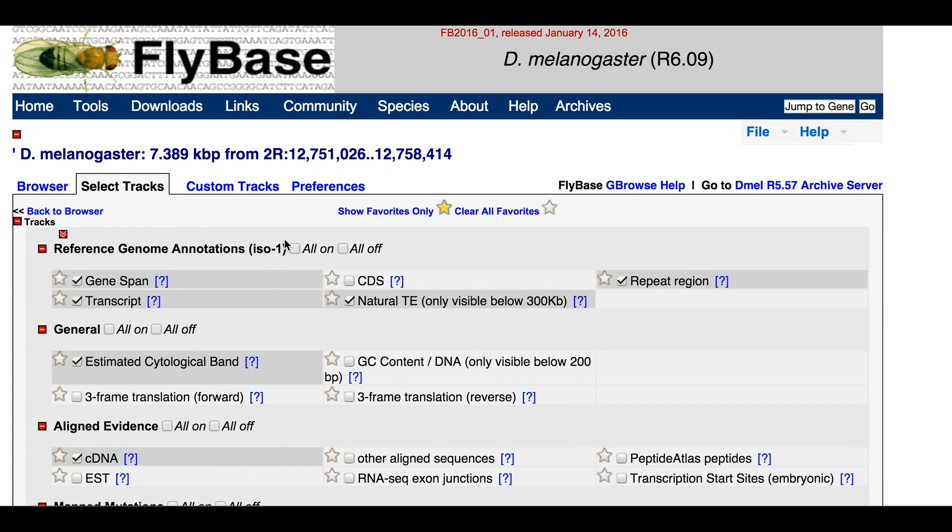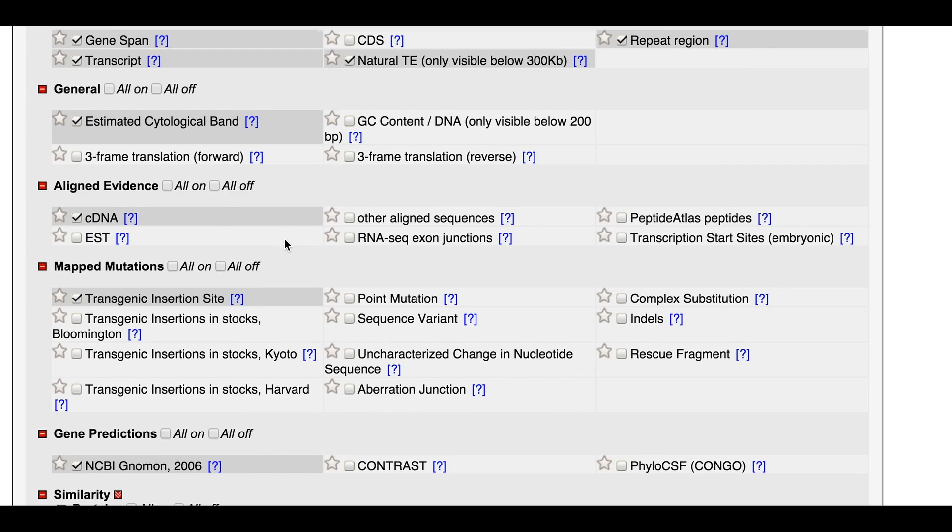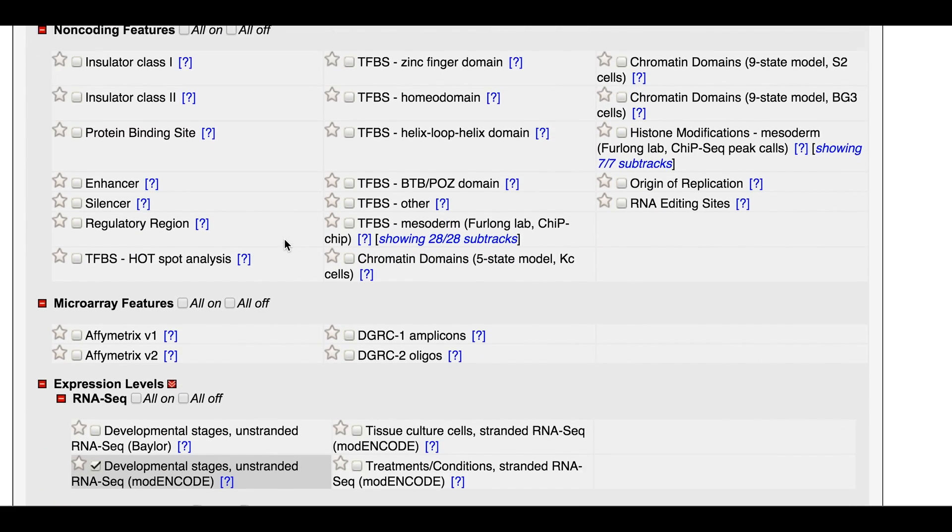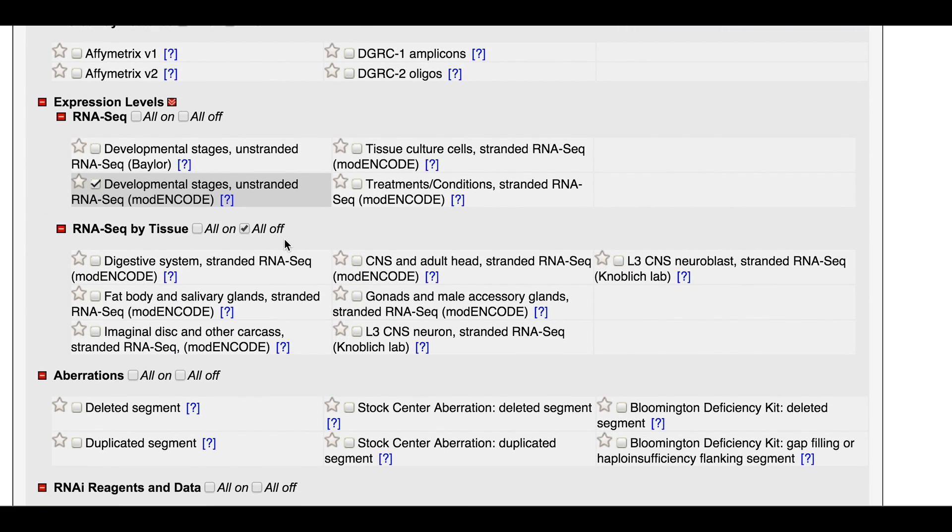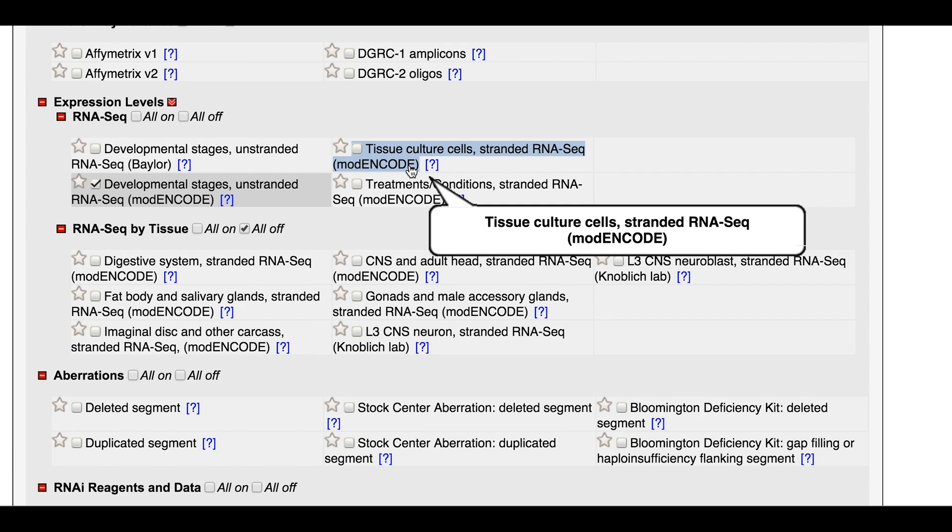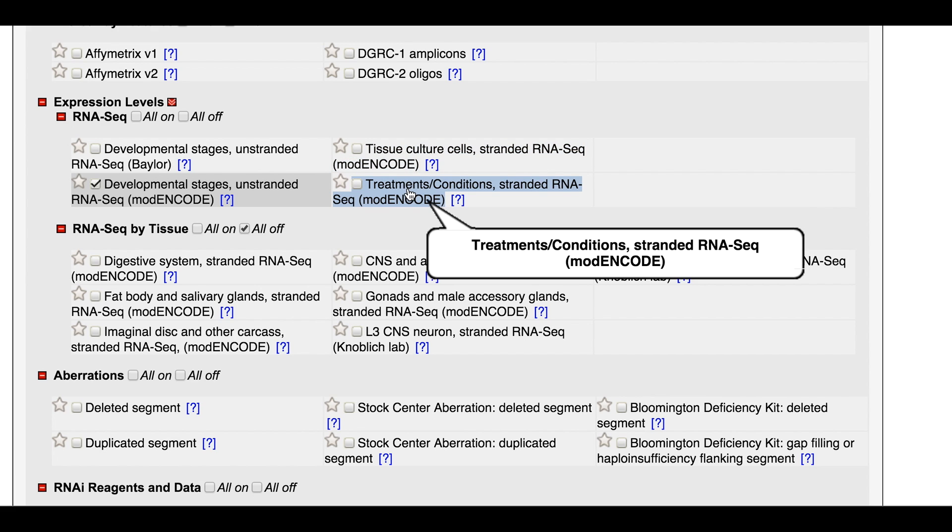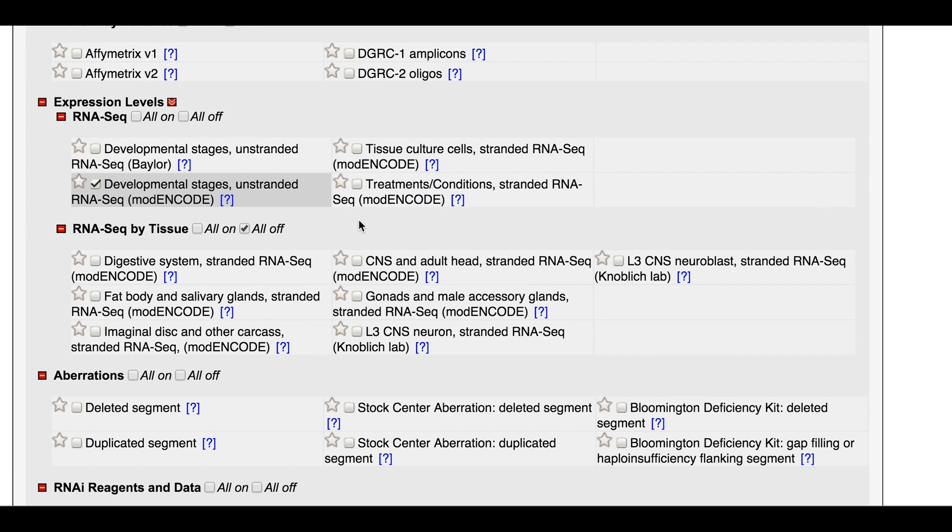Scrolling down brings you to a section entitled Expression Levels. There are data for different cell lines, for different treatment regimens, and for different tissue isolates.